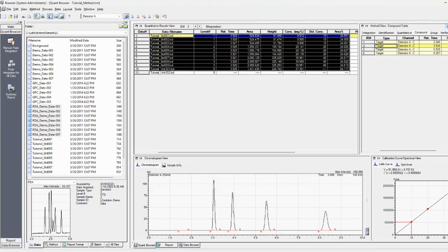If you're doing things in an academic setting, like just copying and pasting everything to Excel and making your own template, that might be easier.